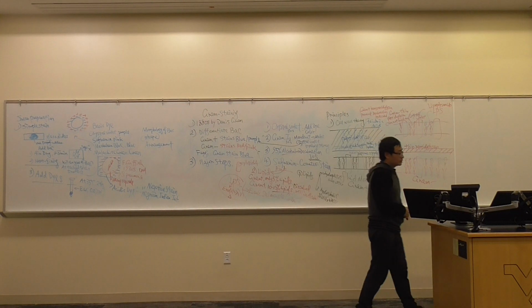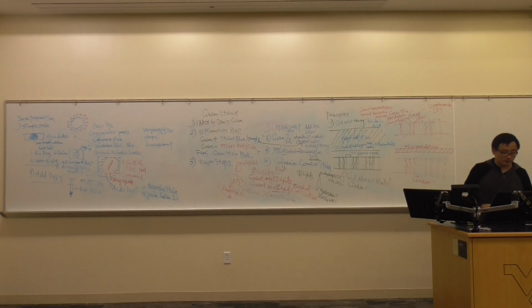Okay, so that's what we have today for the gram stain. We will review this again at the beginning of next class. So we move on to talk about the acid-fast, endospore stain and all the others.